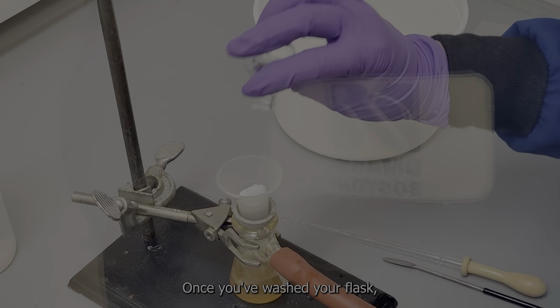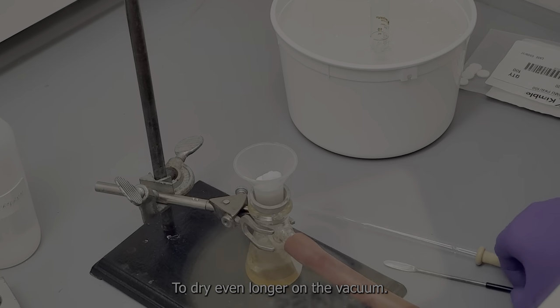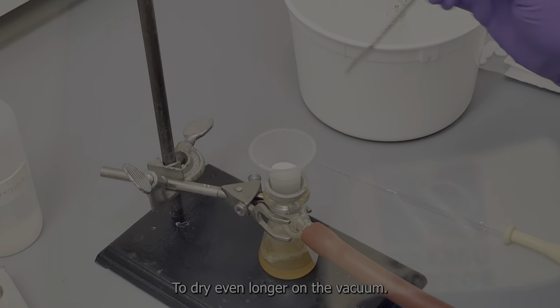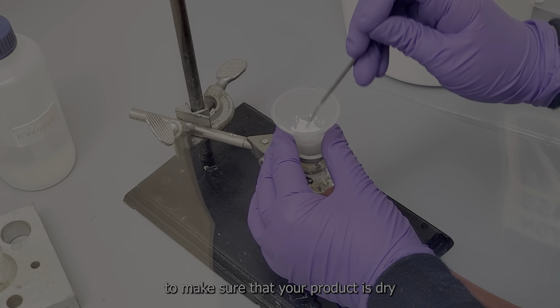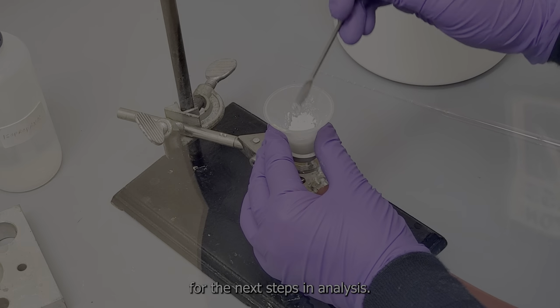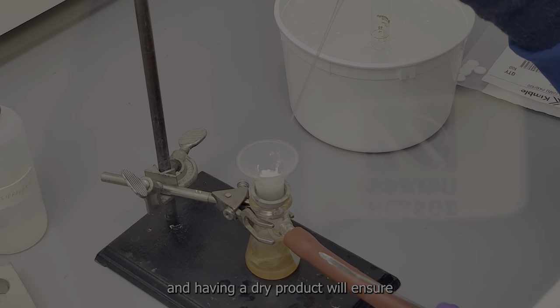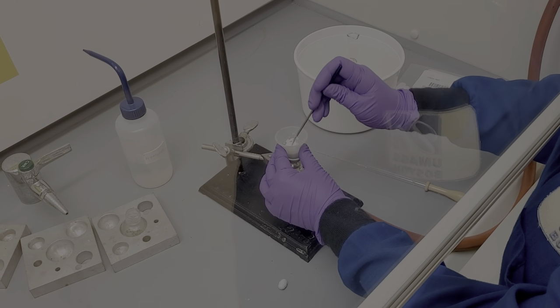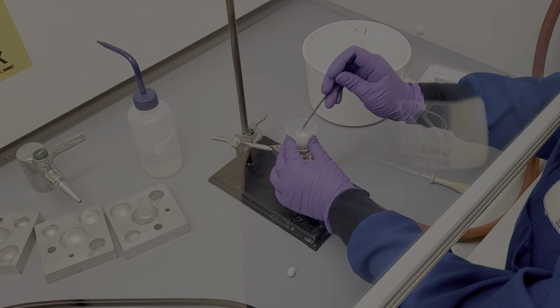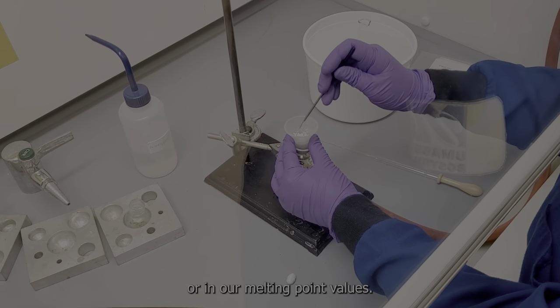Once you've washed your flask, if there's remaining time, you can leave your sample to dry even longer on the vacuum. This will help aid the drying process to make sure that your product is dry for the next steps in analysis. Remember, we will be doing IR analysis and melting point analysis, and having a dry product will ensure that our measurements are accurate, meaning we do not have the interference of water in our IR spectrums or in our melting point values.